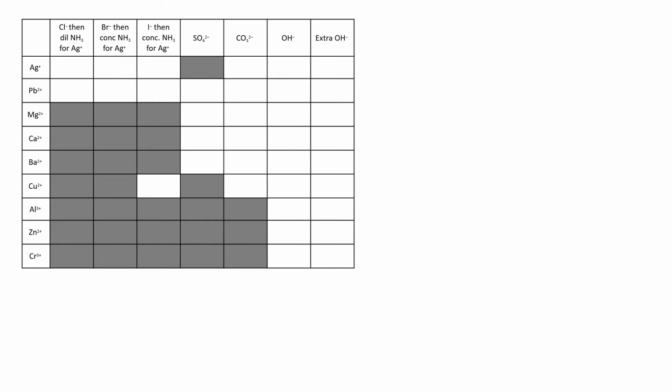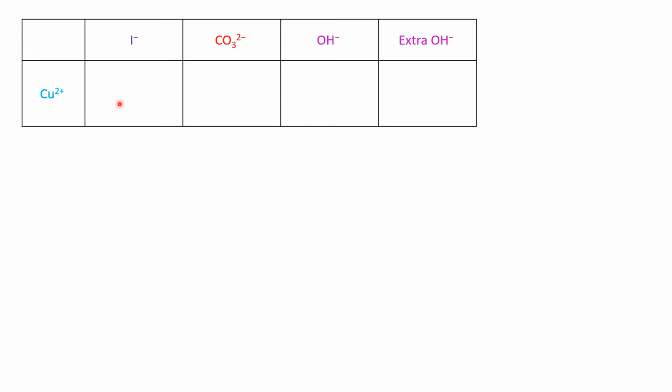So moving on, what's next? We've done silver, we've done lead, we've done the group 2s. Now let's go to the copper. Not much to do with the copper really, just one very important addition and a couple just for the fun of it.